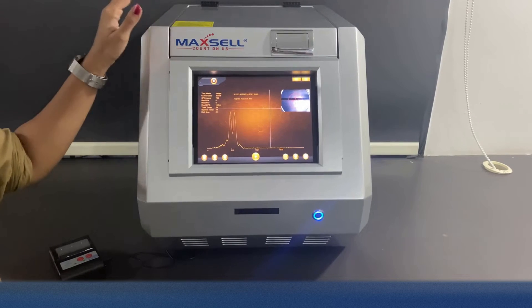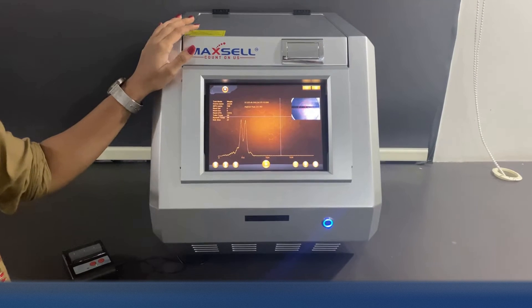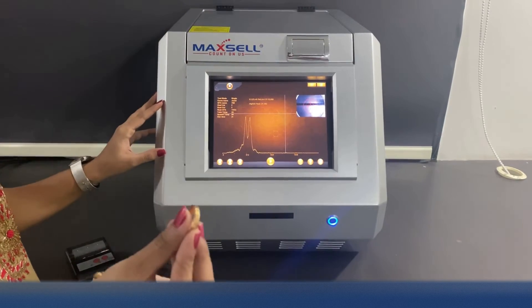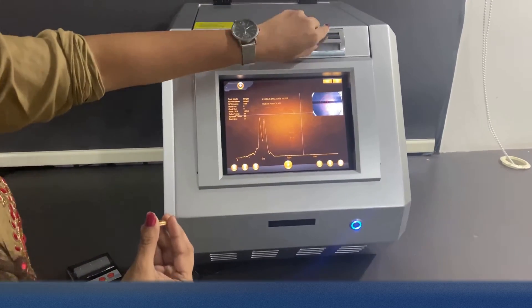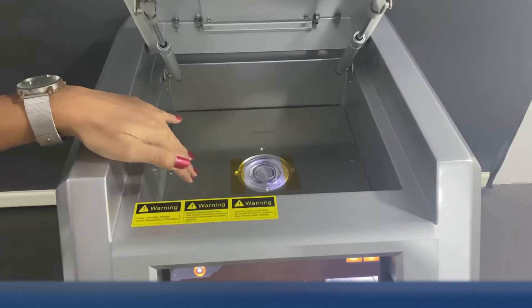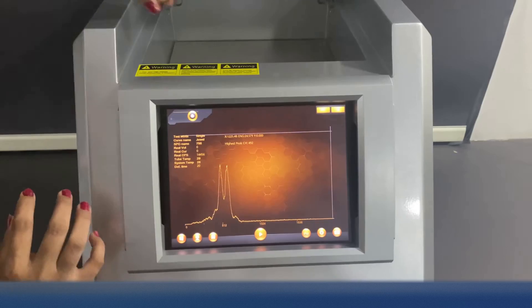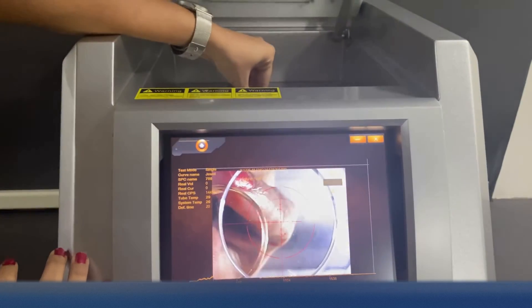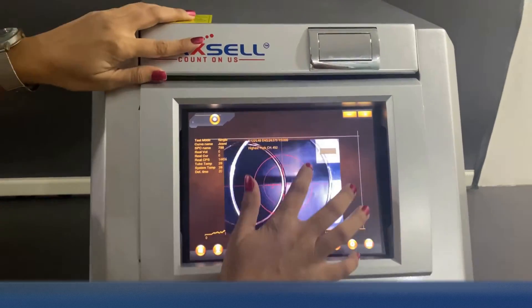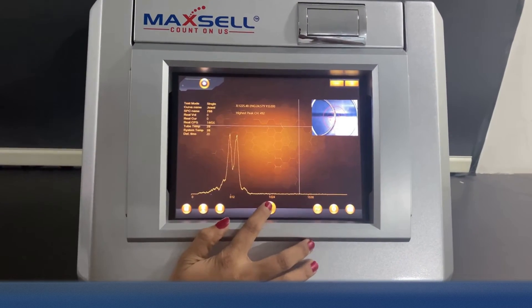Hello everyone, today we are here from Maxsell Technologies. This is our gold testing machine, MXGT Karat Pro. I will show you a demo of this machine. I have a gold ring that we will be testing in the machine to show you how it works. Here is the testing chamber where you can test samples of any size, big or small. You can zoom in to the jewel sample to see its intrinsic details. We can get the results of the gold sample in just 30 to 40 seconds.